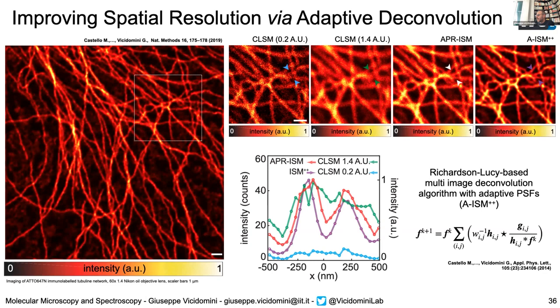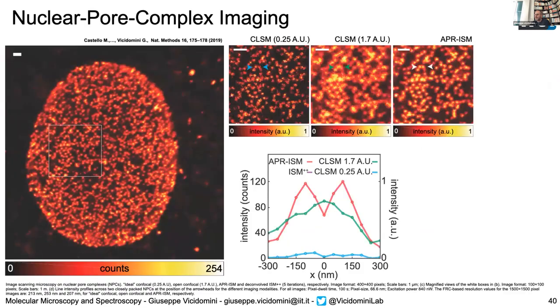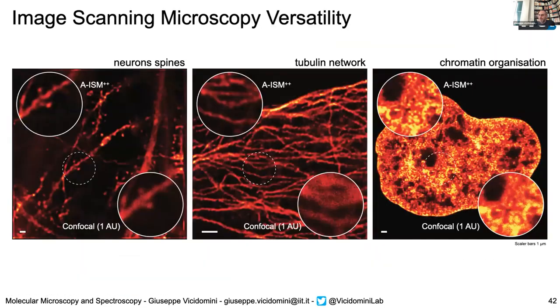Since we are also a lab of computer scientists, we also combine this method with deconvolution, in which you can clearly see that there is a further enhancement of the contrast of the images. We'll go a little bit faster because I want to get to the second part of the talk. Here are a few other results using this technique, because I want to highlight its versatility. It's not like STED, where in some cases you need specific fluorophores or specific conditions. Here is just a system that you can apply with any kind of sample that you typically observe with a confocal microscope.